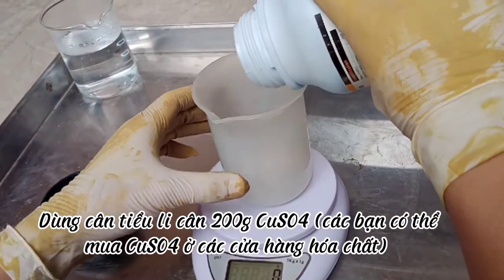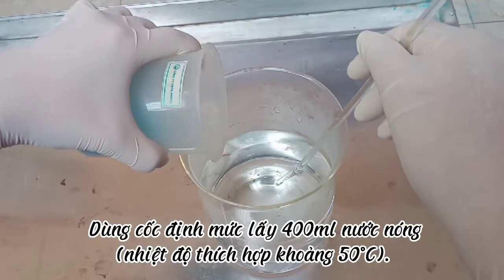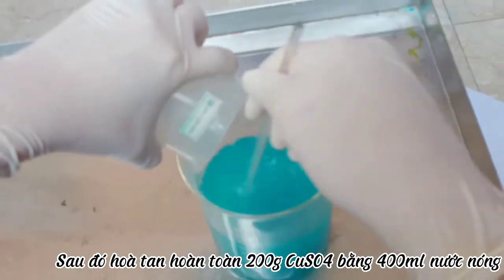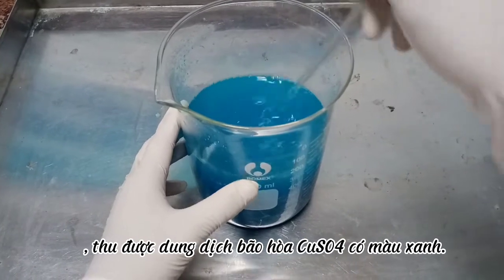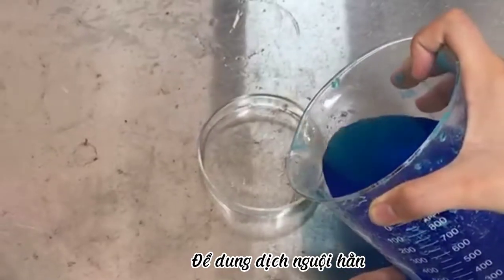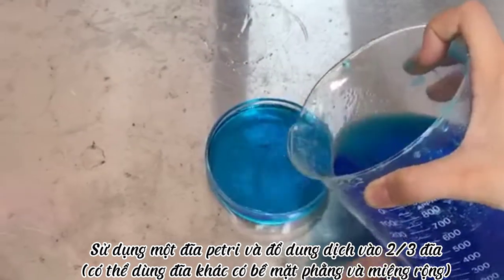We use a precision scale to weigh 200 grams of copper-2 sulfate. Then, use a measuring cup to take 400 ml of hot water. Then, completely dissolve 200 grams of copper-2 sulfate with 400 ml of hot water, and we'll get a saturated solution of copper-2 sulfate blue. Let the solution cool completely. Then, use a petri dish and pour solution into 2/3 of the dish.